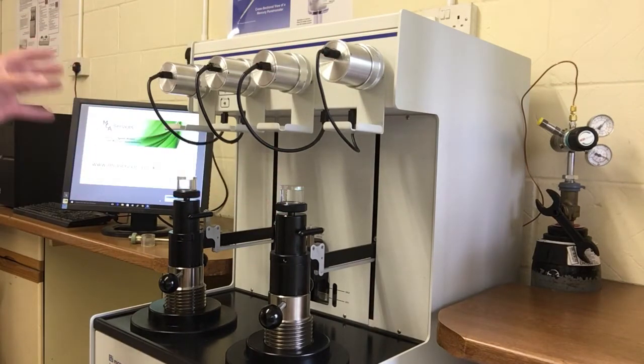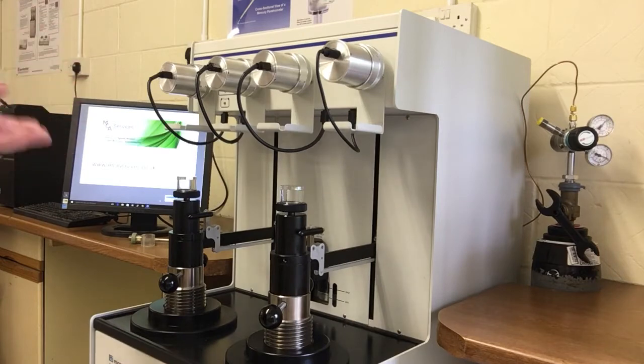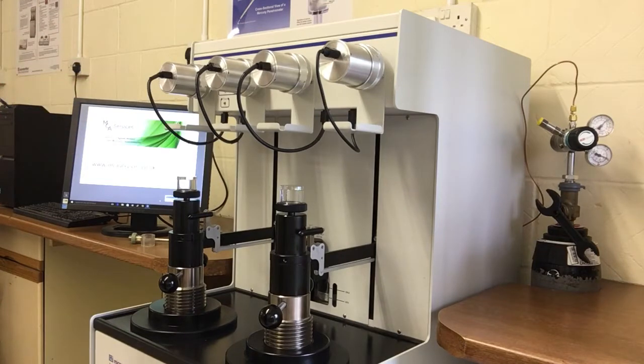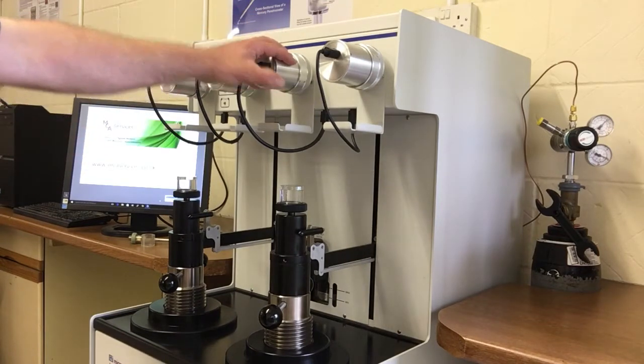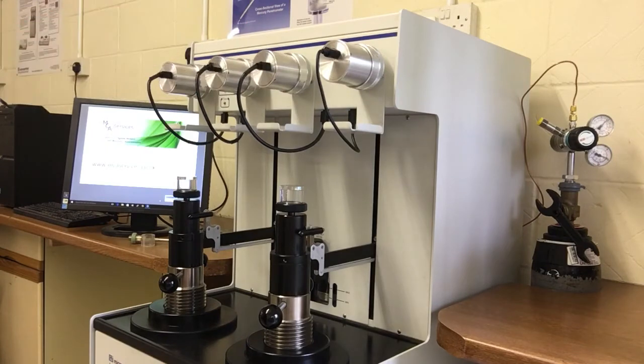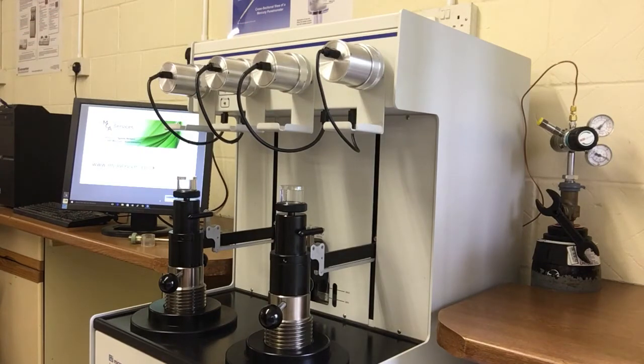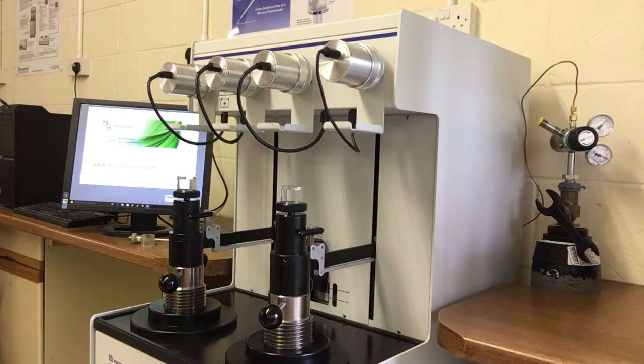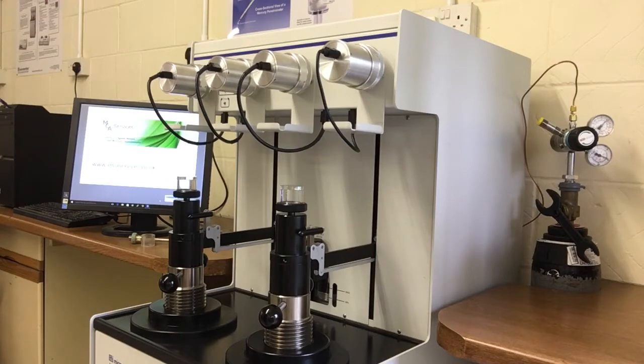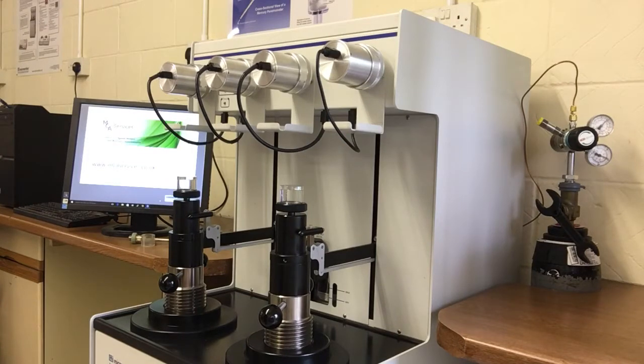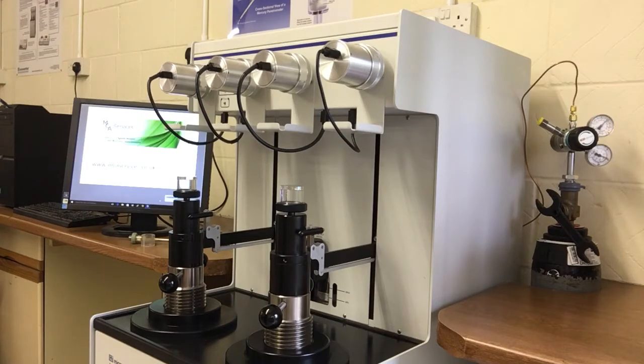Low pressure analysis is undertaken first and the penetrometer will be inserted into one of these ports. It's first evacuated and then it's backfilled with mercury. The low pressure analysis then starts and pressure is increased from below atmospheric pressure to above atmospheric pressure. And that increase is undertaken using a gas cylinder which can just about be seen on the right hand side of the instrument.